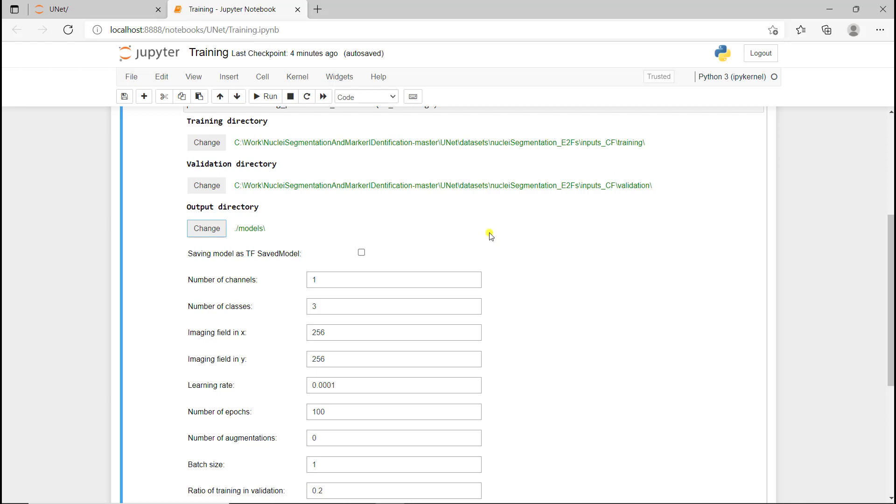For example, if you have collaborators who are interested in using a model trained for a given segmentation, like the U-Net model for nuclear segmentation, but they don't know how to train or use notebooks, they can still use this model in Fiji as long as it's in the right format. If you click on this, you're going to have a zip folder for your model in addition to your actual model in H5 format, and then you can use it in Fiji and give it to collaborators.